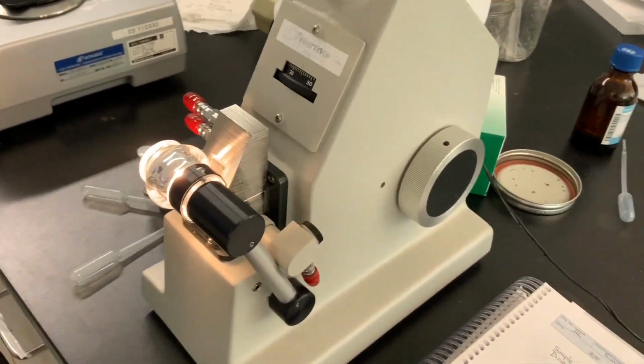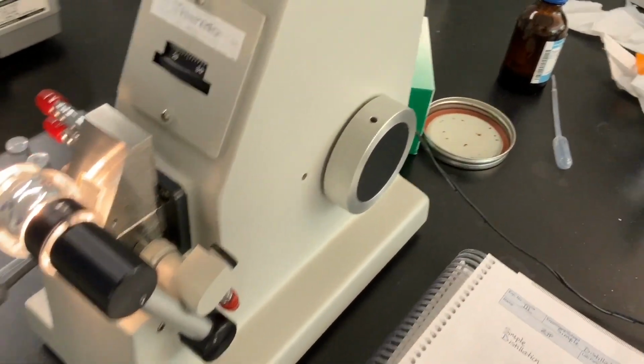and now we're going to look down the eyepiece. And there we are. I'm going to fine tune it just a little bit. All right, and then now we've got our vernier scale.